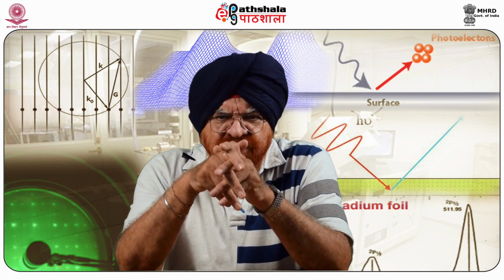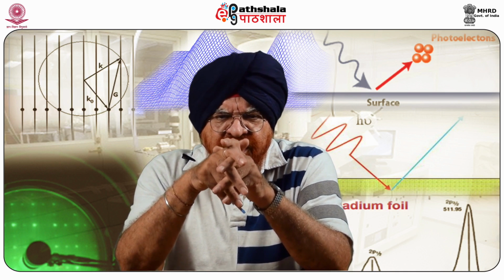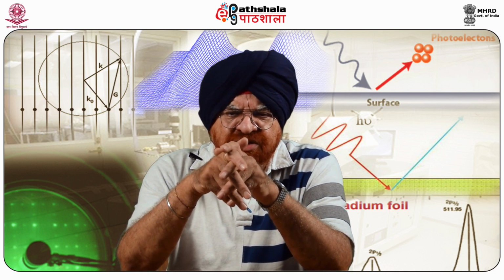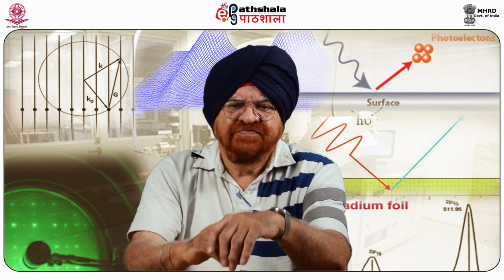Chemical state analysis of the surface of a silicon wafer reveals chemical shifts due to the presence or absence of the chemical states of silicon in its different oxidation states.